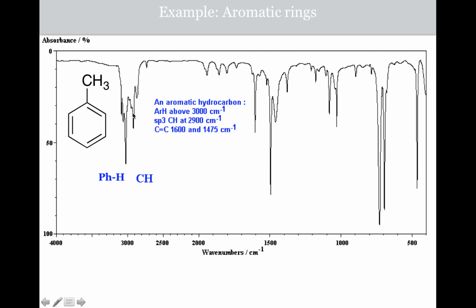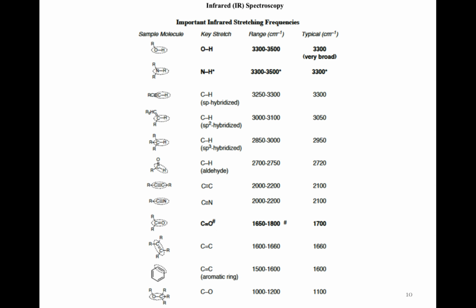Which one is this? Another thing is the carbon-carbon double bond around 1600 and around like 1500 from carbon-carbon double bond stretching. So all of these approximate stretching wave numbers I gave in the examples and their corresponding bond types can be found in a list, and that is posted on box folder under structure determination files.